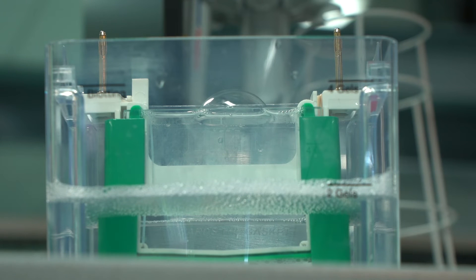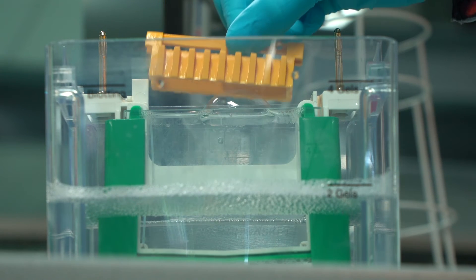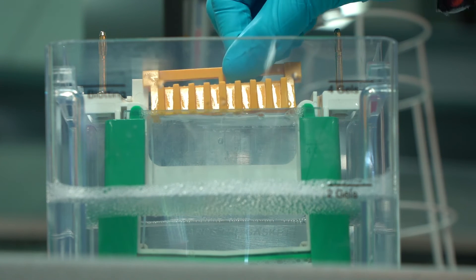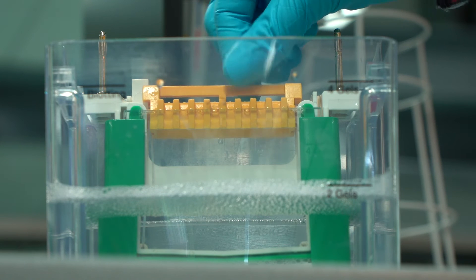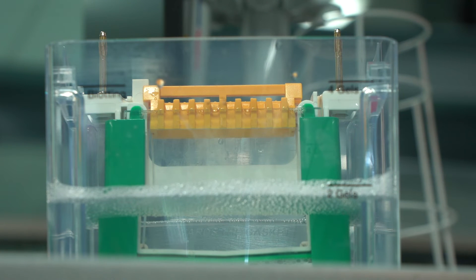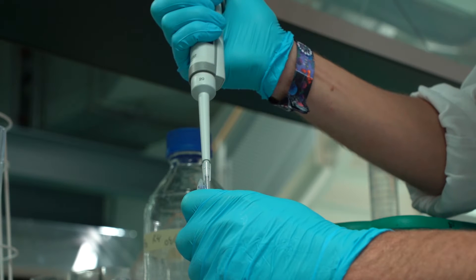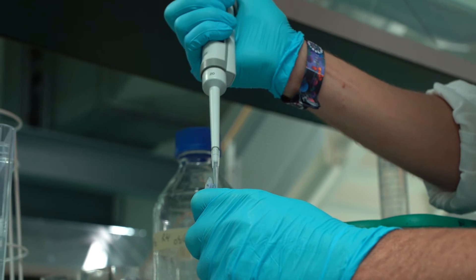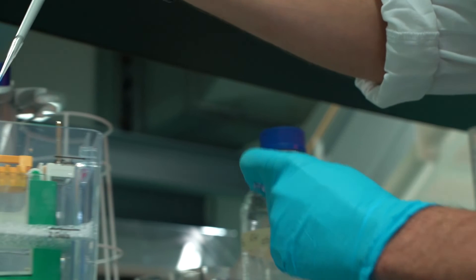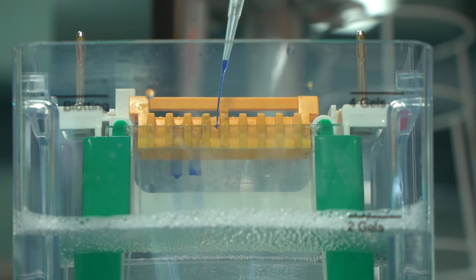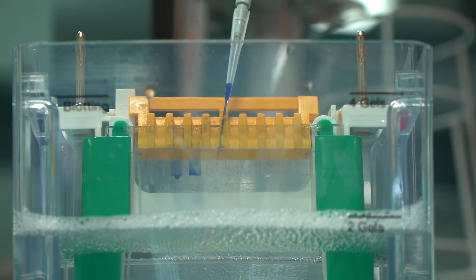For each sample, you must load a minimum of 5 microliters and a maximum of 20 microliters per well. Pipette the sample into the well and pay attention that the sample does not overflow into other wells. You can use the pipette to help you get the sample into the wells. Place a protein ladder next to the samples by pipetting 5 microliters into one well.